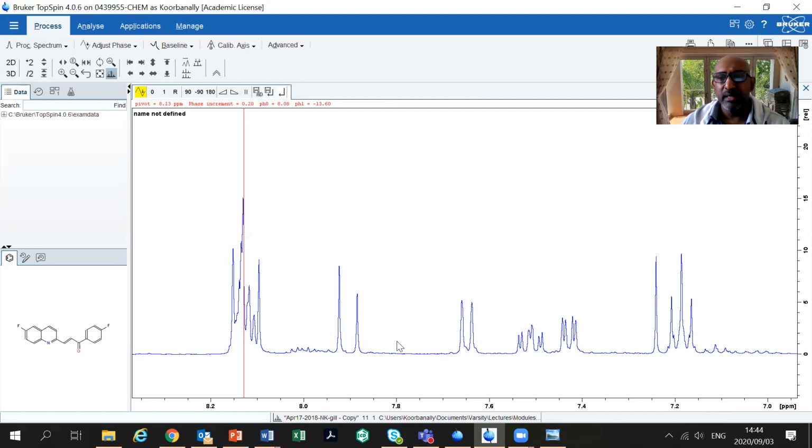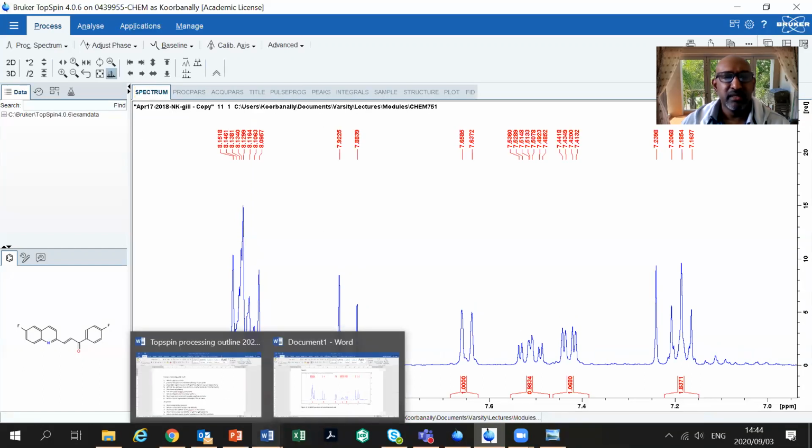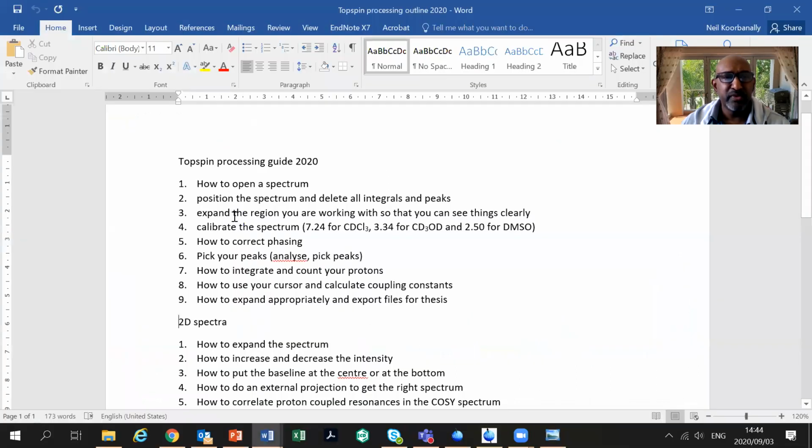All right, so I think I've now covered everything that I needed to cover in this first part of the session. I'm going to stop there and take some questions.